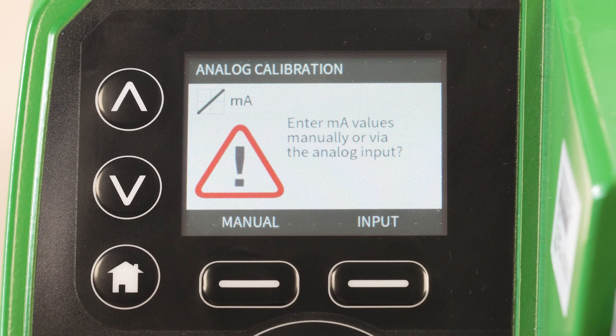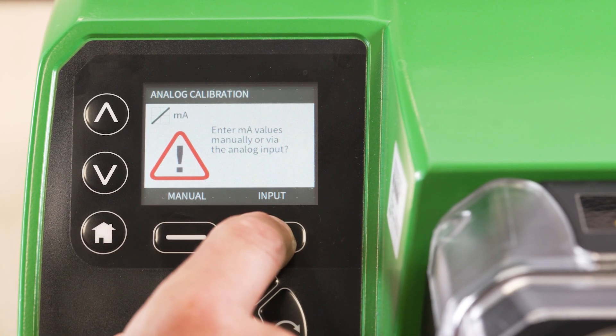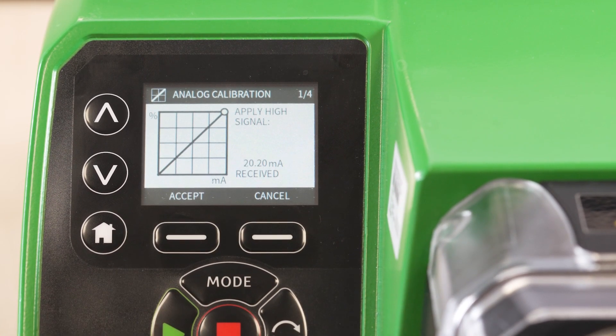Selecting the manual option allows you to set input and output signals on the pump keypad, as well as the flow values. Selecting the input option allows you to set the pump up with the 4-20mA process signal. For this demonstration we will focus on calibration with an applied process signal.